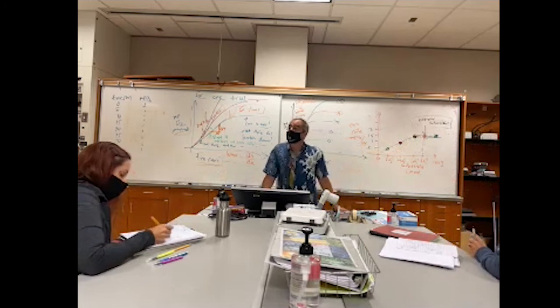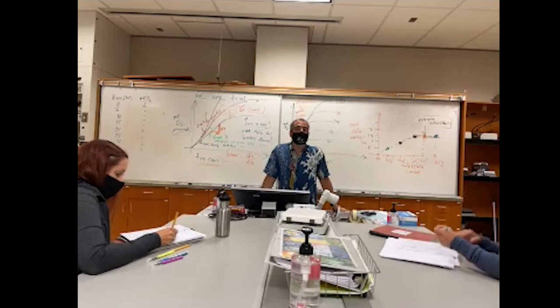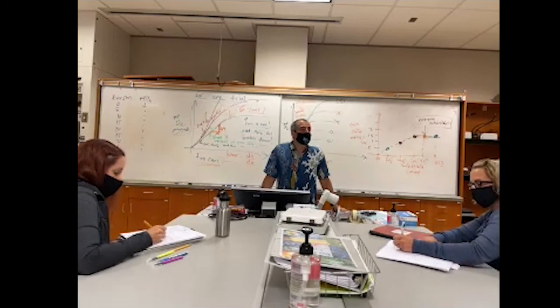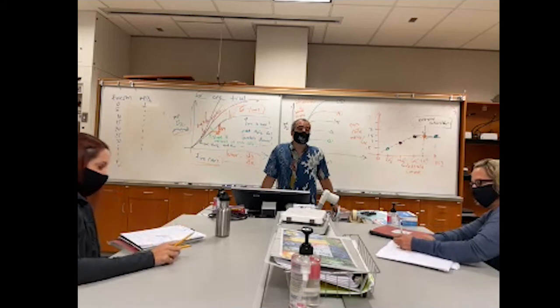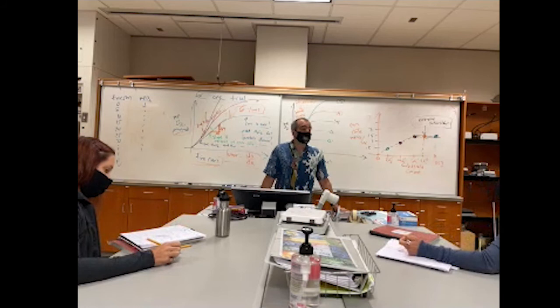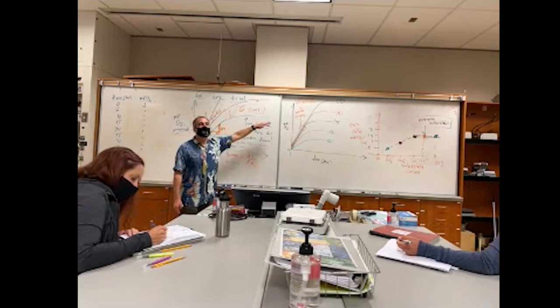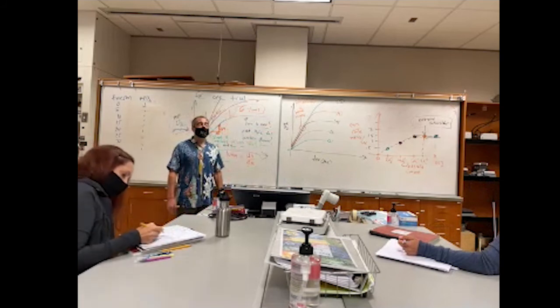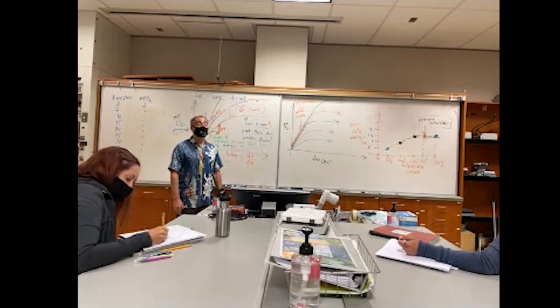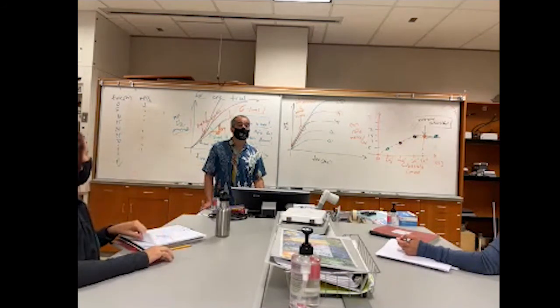And is this something we're doing on Excel? No, I'd rather you do it by hand. Really? Yeah. You'll see why, because it's kind of tricky to do in Excel, because these things are non-linear. They start weird, they start dying. So it's actually easier just to eyeball it and put in your best fit line. I think you are better than the computer at figuring out the best fit line to get the slope.